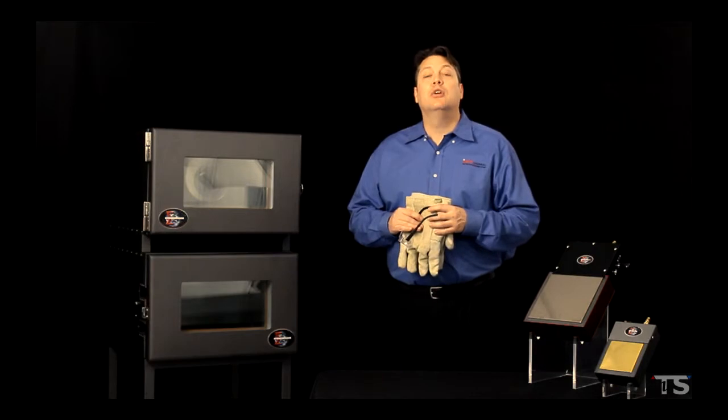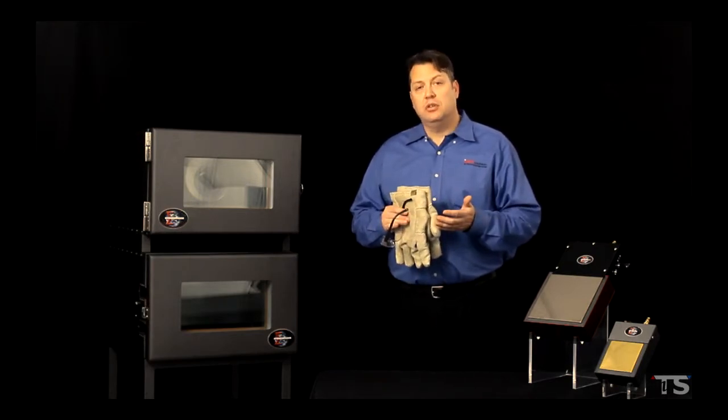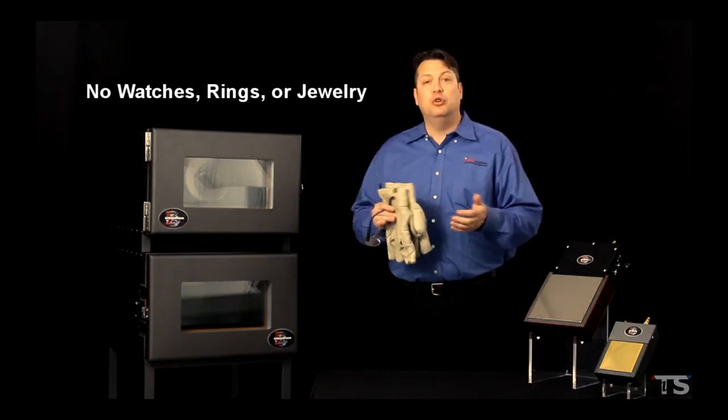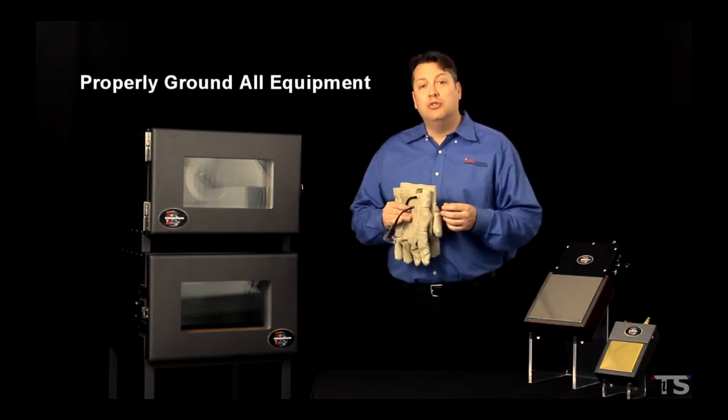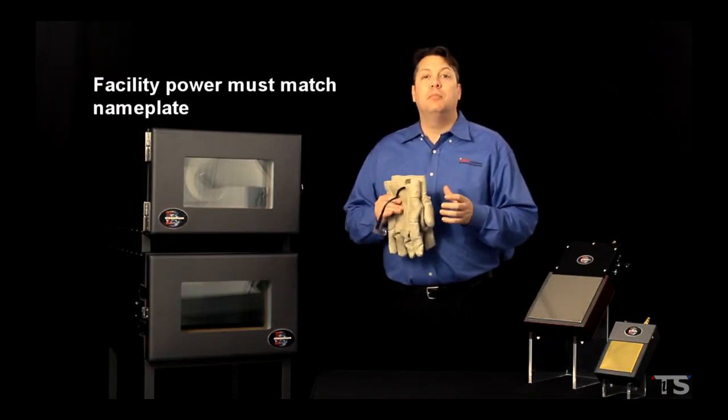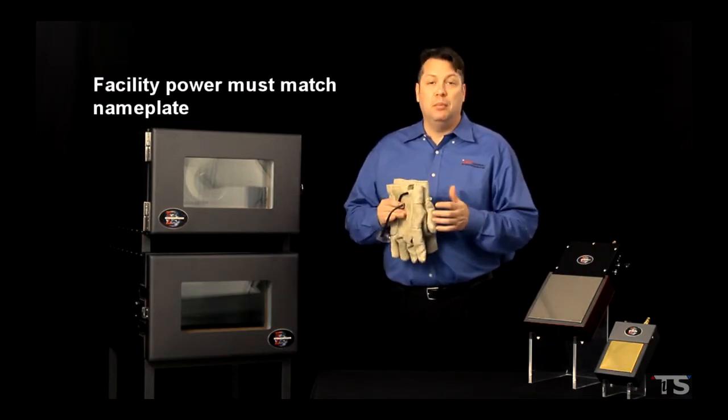In addition to PPE, here are a few other safety recommendations. Concerning electrical safety, we suggest that you don't wear any watches, rings, or jewelry when working around the equipment. Also, ensure the equipment is properly grounded and make sure the facility power matches the equipment nameplate.